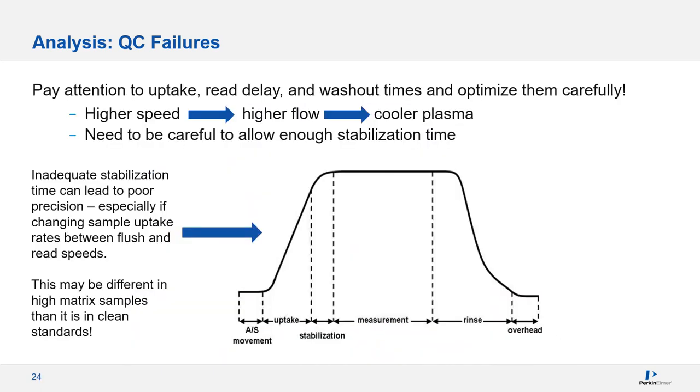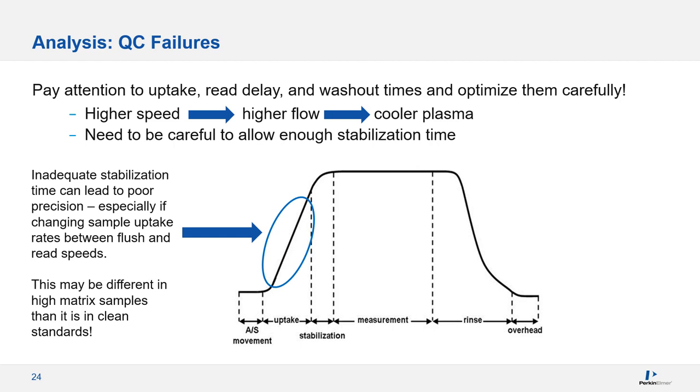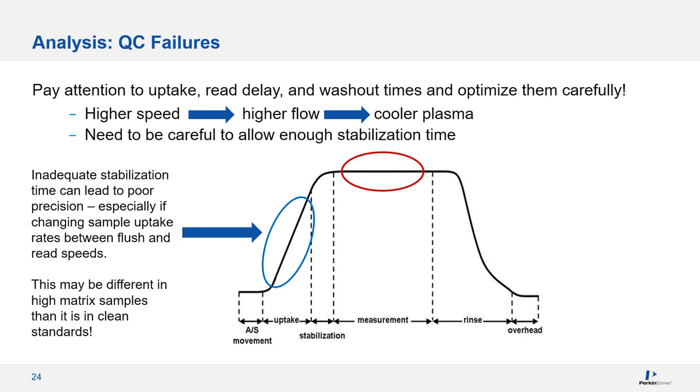One other cause of poor RSDs is improperly set sample uptake, read delay, and washout times. These can be a large part of your sample-to-sample runtime, and should be optimized carefully. Most labs will speed up the peristaltic pump to get the sample from the vial to the nebulizer as quickly as possible. But a higher pump speed means a higher liquid flow, and more liquid in the plasma cools it off. The temperature of the plasma is tied to how it ionizes your analytes. When optimizing your method, if you speed the pump up faster than the speed for data acquisition, it's important to allow enough stabilization time so that the temperature of the plasma is no longer changing when the results are read. This stabilization time is often referred to as the read delay time.